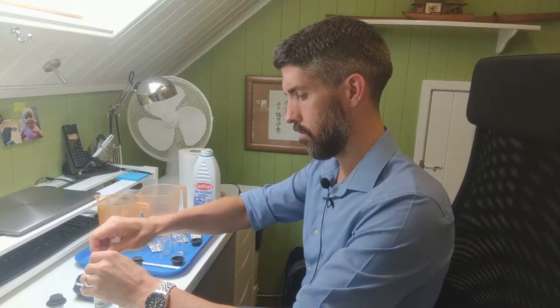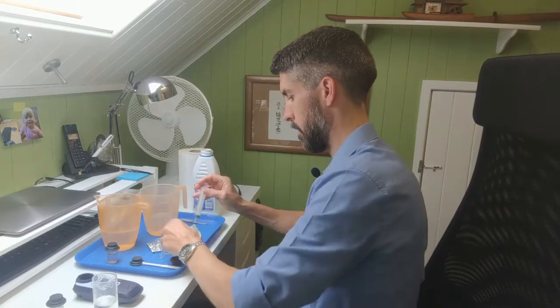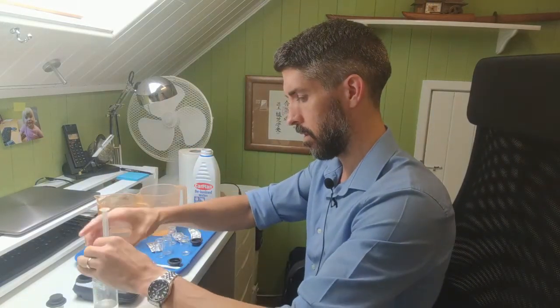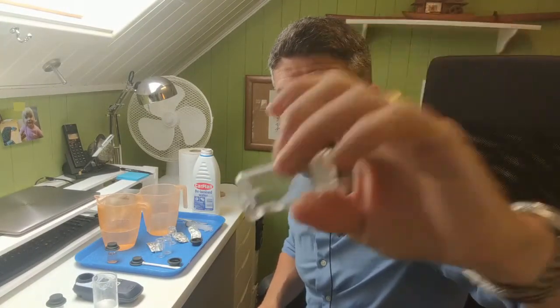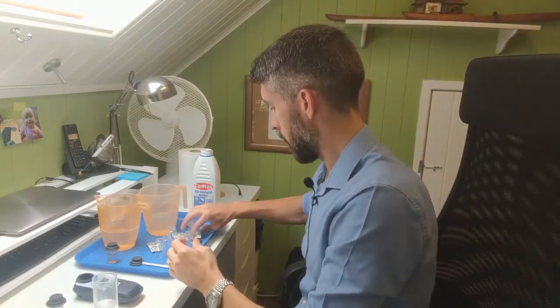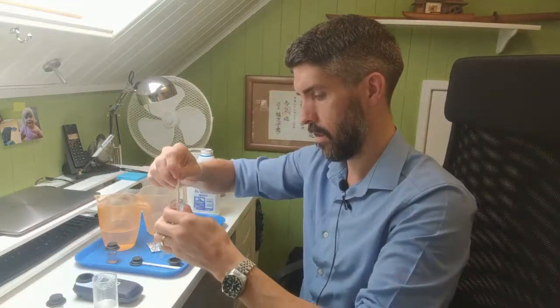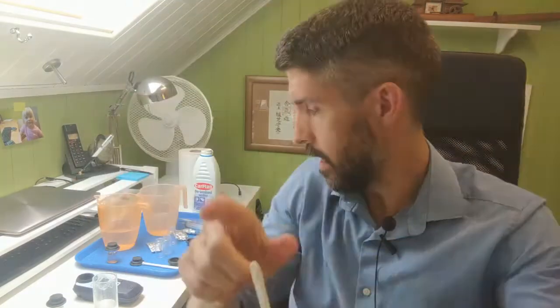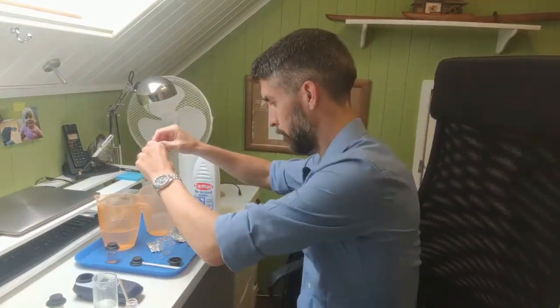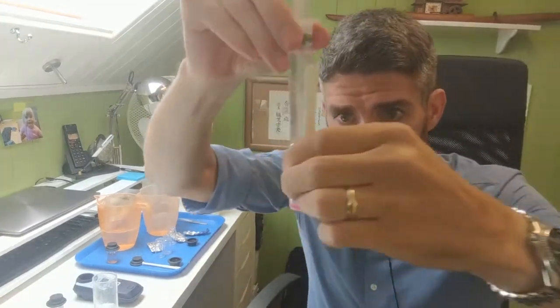So what we're going to do is draw off a sample of the diluted water and rinse out a test tube a couple of times. Again, just leave a few drops of water there, put a DPD-1 tablet in and crush that, observe the color of the water with the tablet in - it'll go a pink color - and then top that up to the 10ml mark with the diluted sample. Again, observe the color.